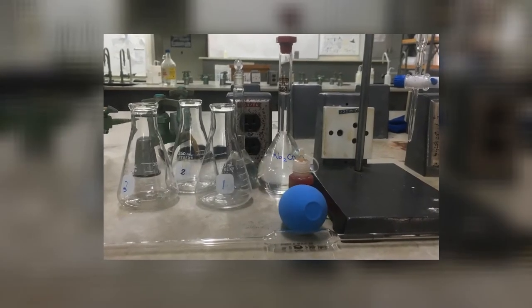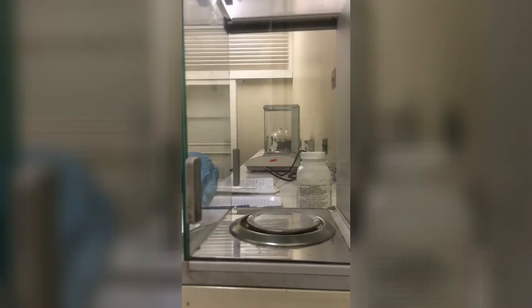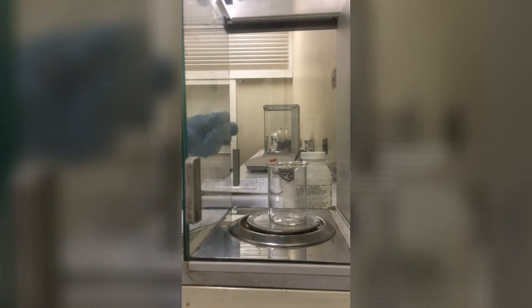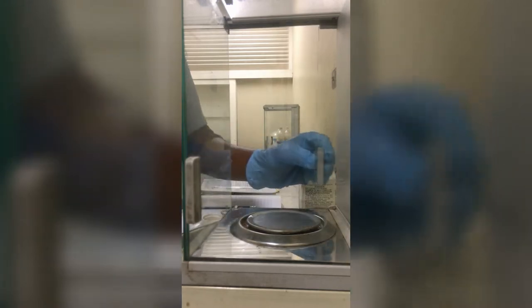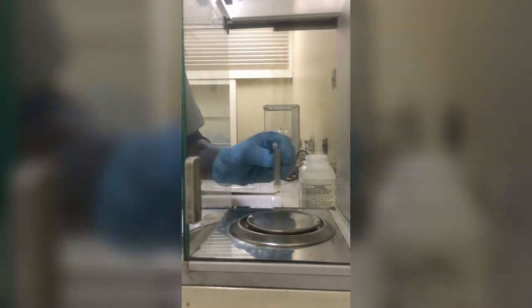This is a picture of the chemicals and glassware that we are working with today. First, we are weighing out sodium carbonate on an analytical balance. Then we dissolve the solid in the minimum amount of distilled water, transfer to a 250ml volumetric flask, and then use distilled water again to bring the bottom of the meniscus to the mark.